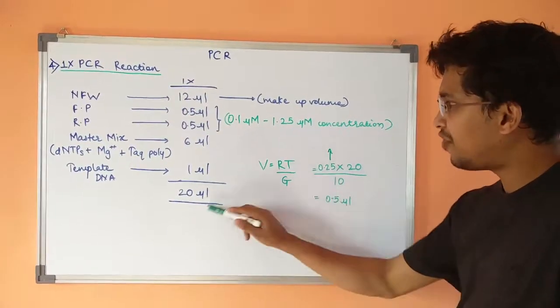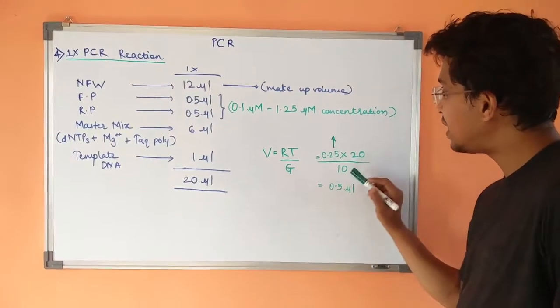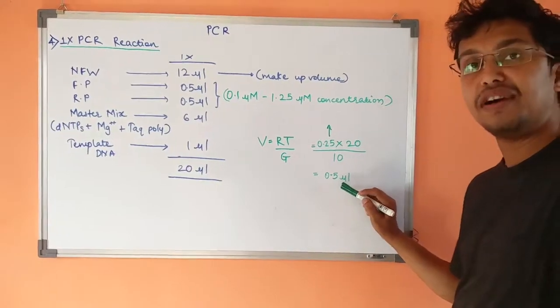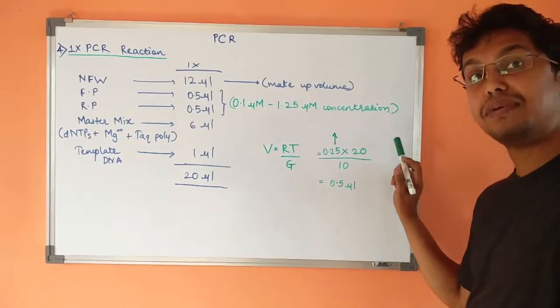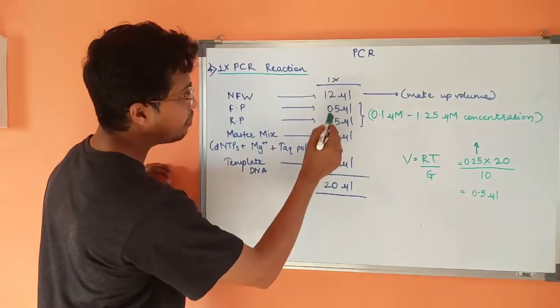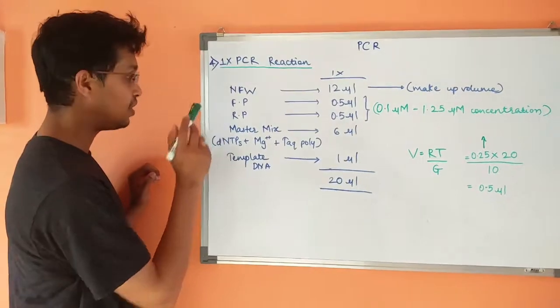My total volume of reaction is 20 µL, and my given concentration of primer is 10 micromolar. That comes out to be 0.5 µL, which I can add from 10 micromolar. This is how I have added 0.5 µL of forward primer and reverse primer each.